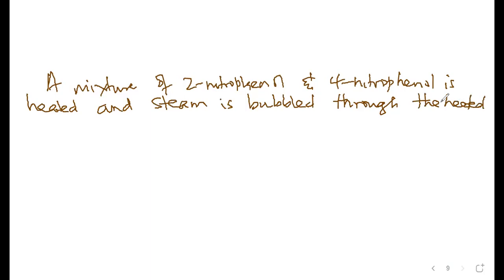These are very simple things. They make chemistry very enjoyable. Steam is bubbled through the heated mixture at a certain temperature.